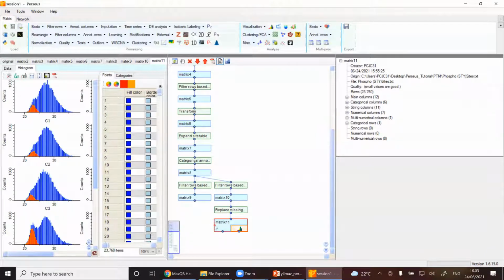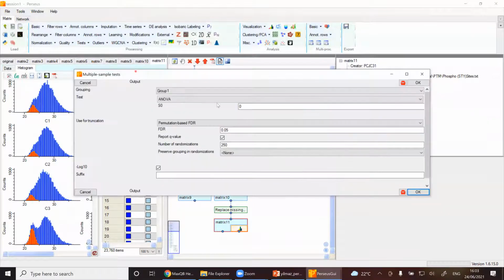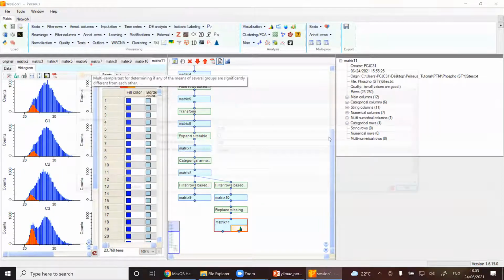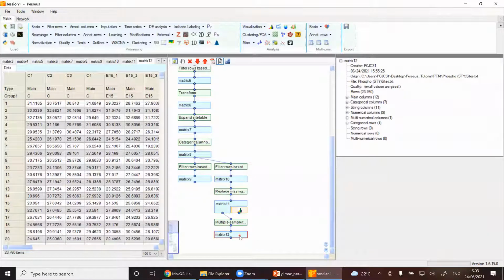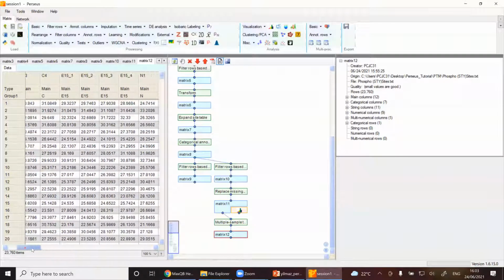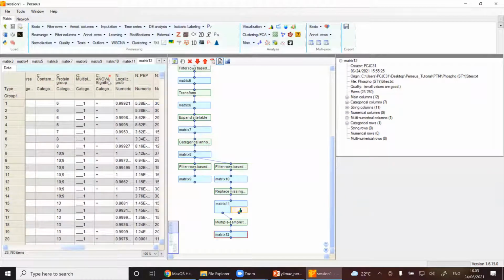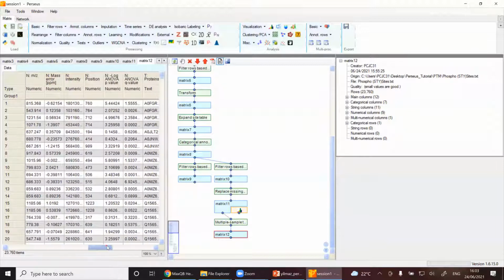And what we will do is the sample test. Daniela just explained it, so I will not explain any further. In this case, I keep the settings as default. I just go to test on the processing, multi-sample test, and okay. And on this matrix, we now have a column called ANOVA significant. And then later there were some other values about this, like P value and Q value.